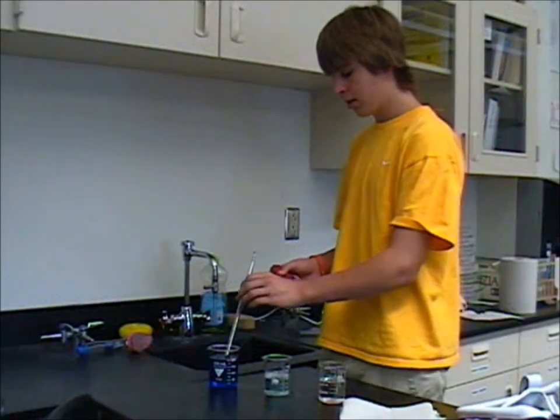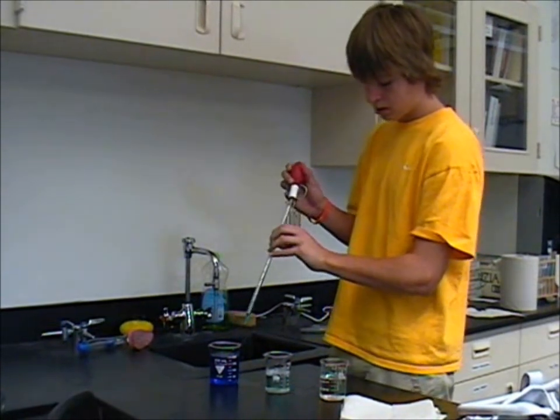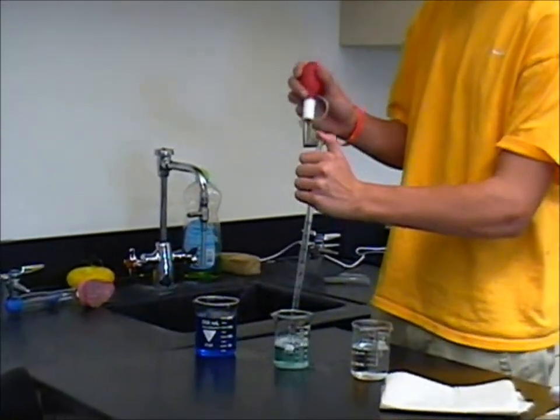To clean the pipette, get a beaker full of water and soap. Again, use the bulb to gather the water and soap solution into the pipette. Put your thumb on top and rotate over a sink.